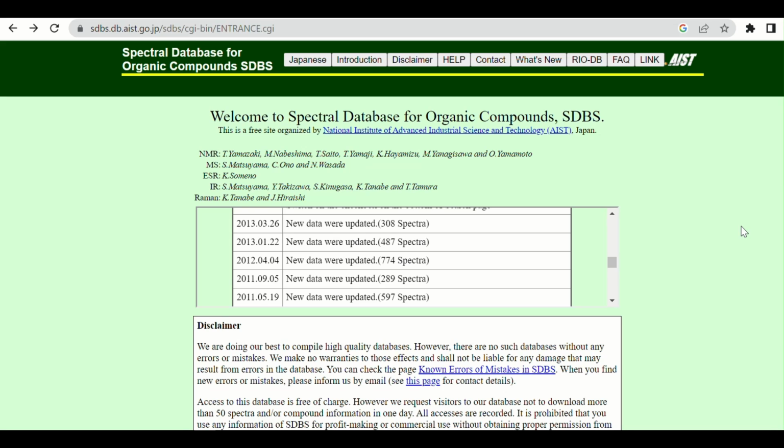This video is specifically useful for synthetic chemists who synthesize compounds on a day-to-day basis and very often need spectral information of some known organic compounds, but they do not have access to it or might not have those compounds available in their lab to collect their data. And to resolve this issue, here is an easy solution.